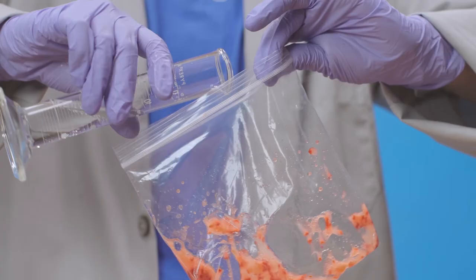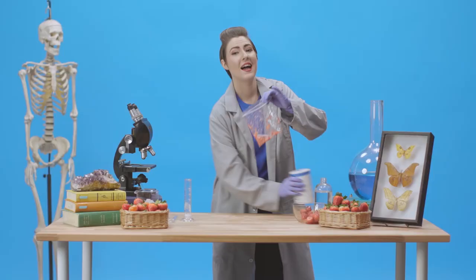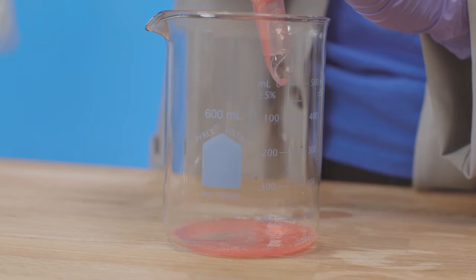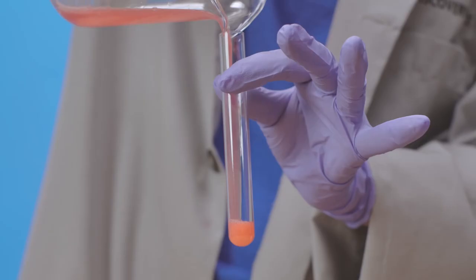And now that it's pretty mushy in there, we'll add some detergent solution to help break down the nuclear membrane, and a little salt to help that DNA stand out. Next, we'll take a coffee filter and funnel this mixture into our beaker, then transfer some of this to a test tube.